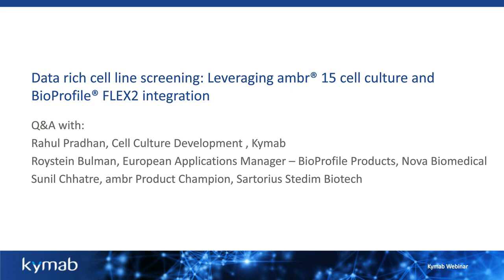We have another question here about the feedback control loops. Is the feedback control hard-coded into the process steps, or is it entered manually based on glucose measurements? So for this experiment, the feedback loop was actually hard-coded into the experiment. But obviously, during the clone screen process, depending on the glucose consumption rate, we were tweaking it. But as we get more process data for a specific clone, Thank you very much for that, Rahul.